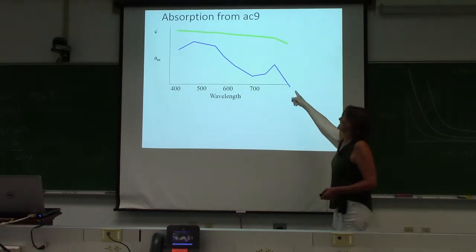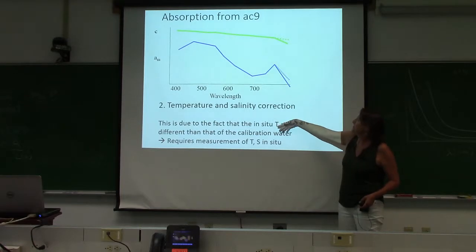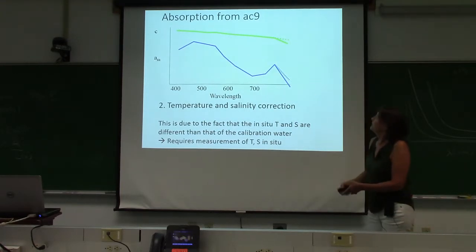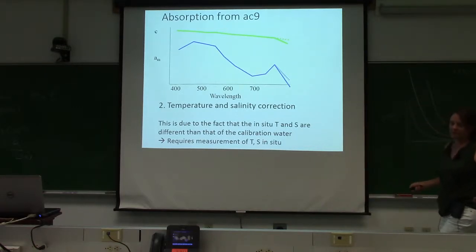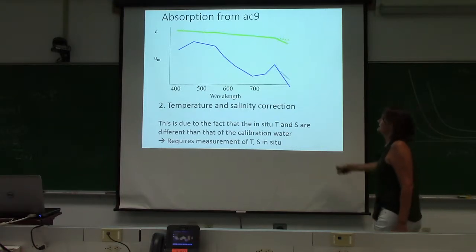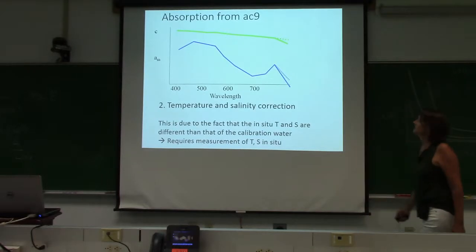So, the first thing I notice is this. It's negative, right? So you do your temperature and salinity correction, and whew, it pops you right up. And it pops you right up here because, of course, a beam attenuation also has absorption in it, so it also has a temperature salinity correction. And so that's nice, but now we have this offset here. So we have to think about that.